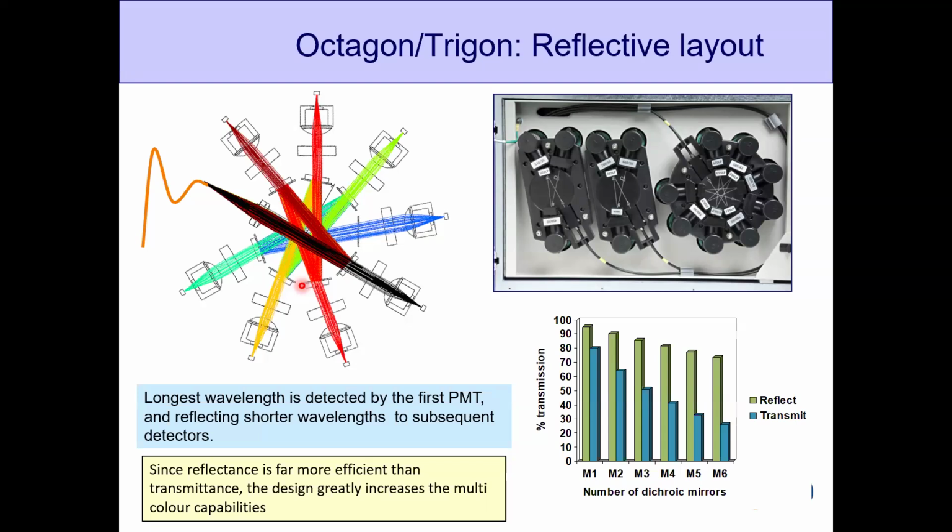And if there is a conservation of energy, you won't lose your signal, because again, it is hitting that detector or that filter first, which has the lower energy. So there will be no loss of energy. And if there is no loss of energy, then there is no loss of your signal, because again, your signal is made up of your photons, right? And if you are not losing those photons, then if you are giving 10 photons, you are getting a signal of 10 photons, not 5 or 8.